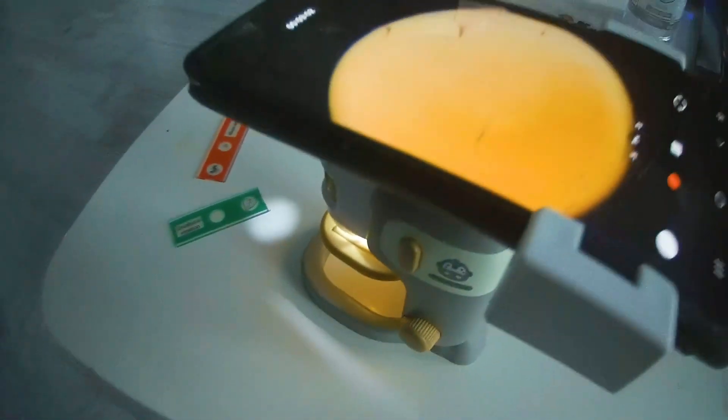We can put a bee's wing, for example. We can move the slide around, like I'm doing here. There it is. And there you go. There's your bee's wing.